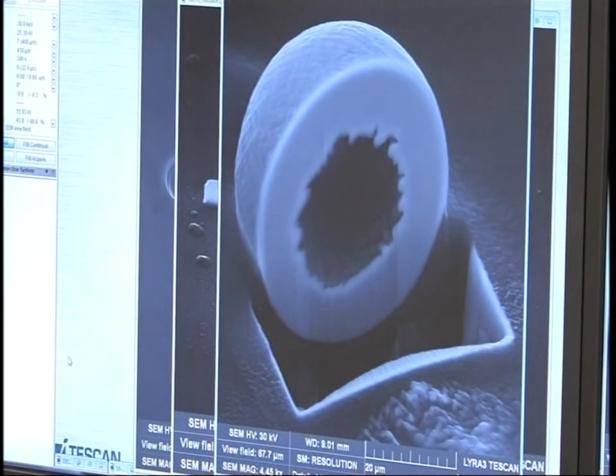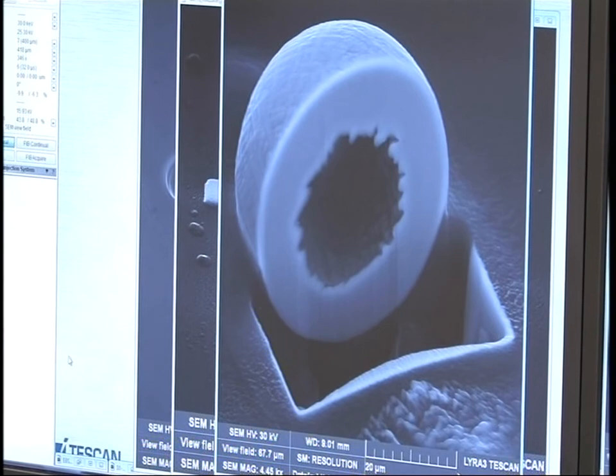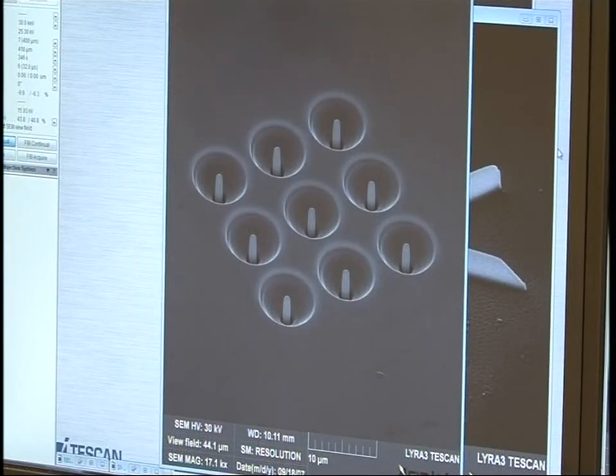To be specific, it is gunshot residue. Another example shows the generating of pillars, which are used for micromechanical testing.